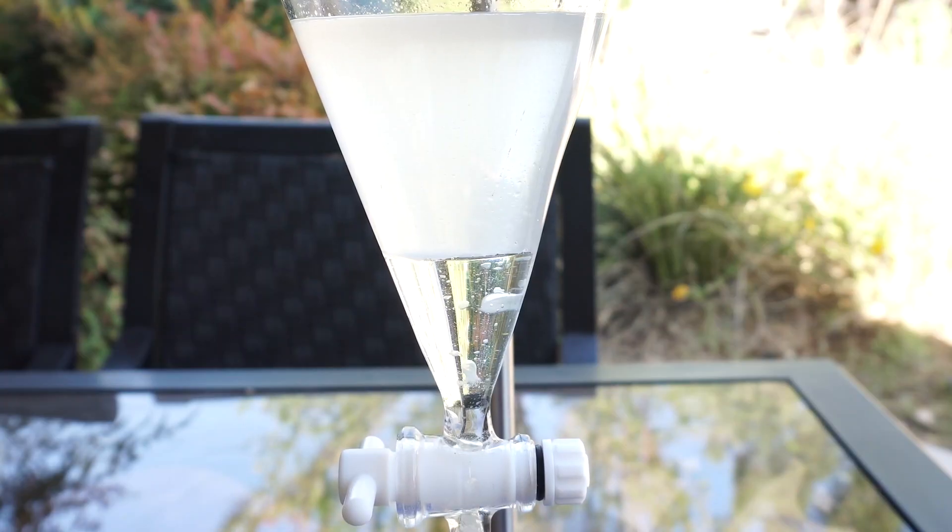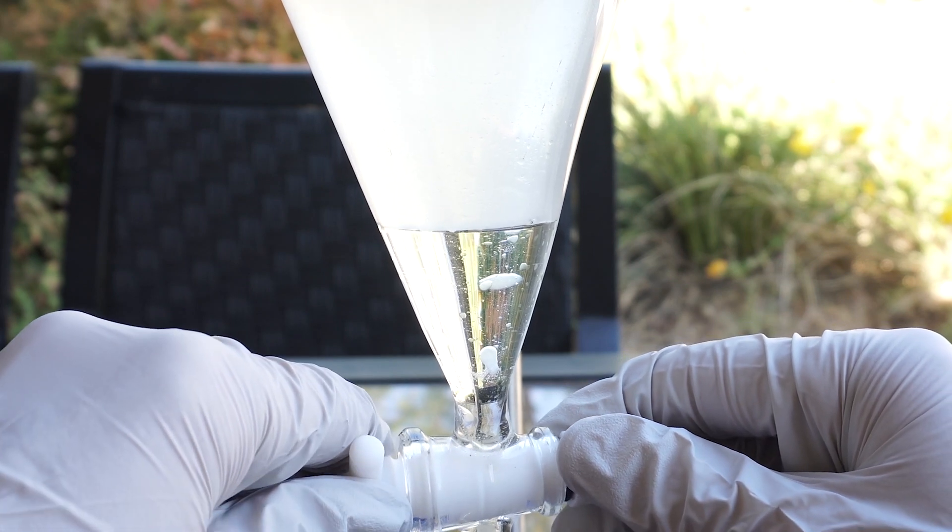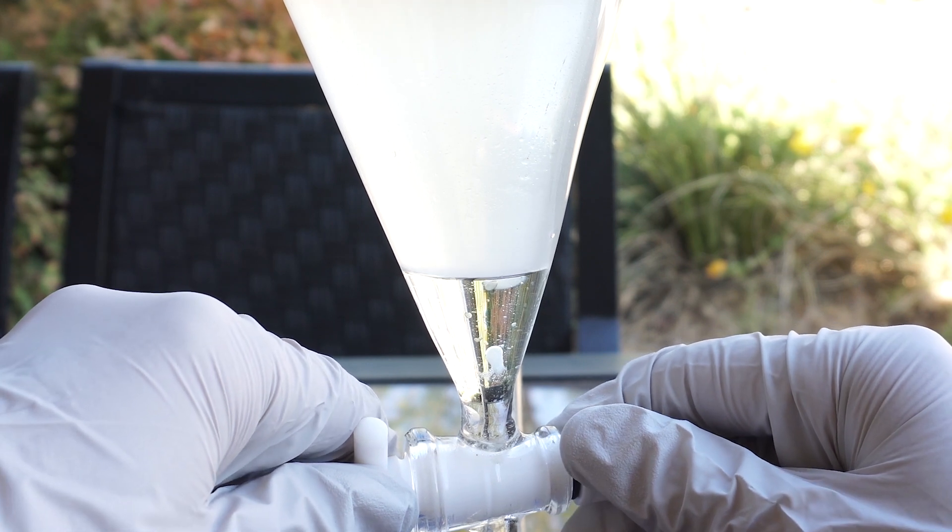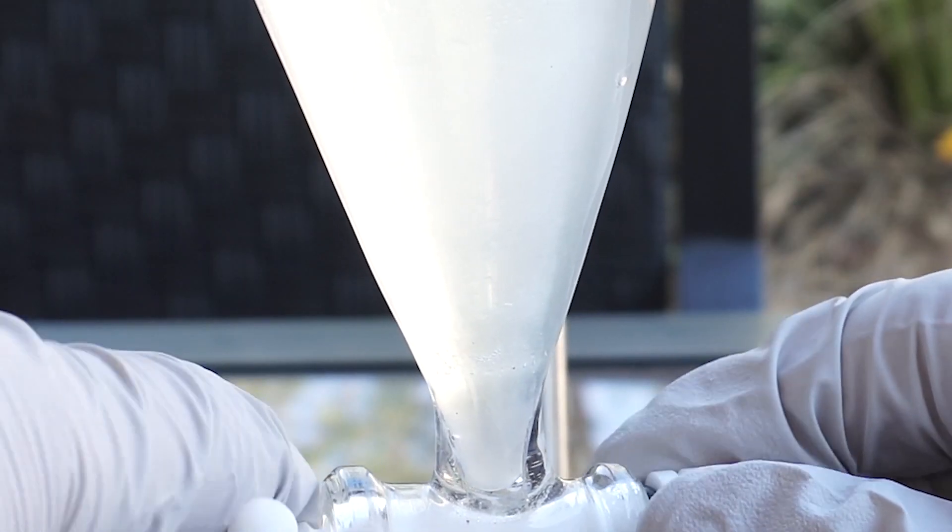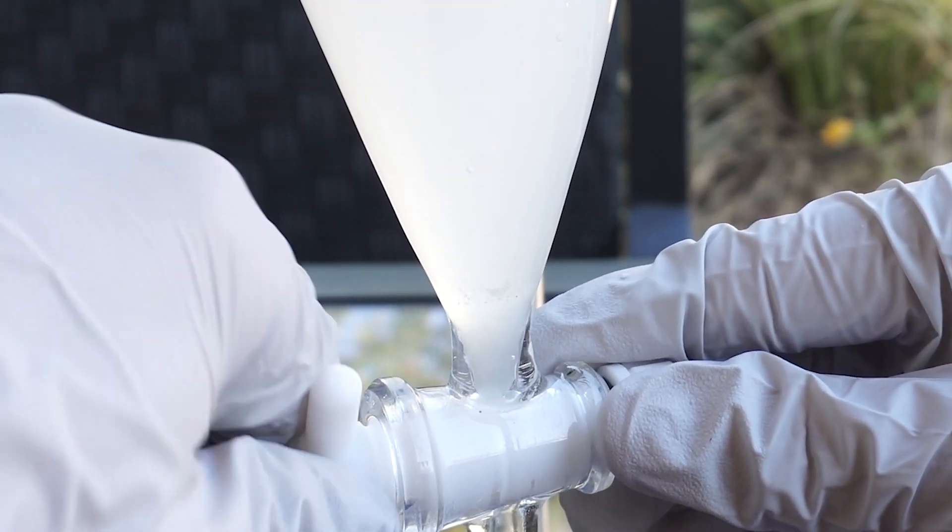We allow the layers to sit and separate out the lower DCM layer into a flask. I then repeated this step 6 times until I had used 150 milliliters of DCM. It should be noted though that I recovered about 149 milliliters of the 150 milliliters, so almost nothing was wasted.